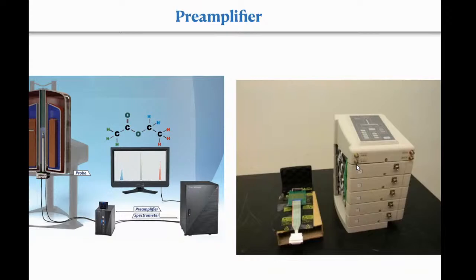Why do we require a preamplifier? Because the signals that we get are very, very weak, in millivolts or even smaller. We need to at least amplify it, because by the time this signal travels from here to the console here, it would have dissipated and your sensitivity will be lost. Okay, there will be so much resistance going through these wires, right? So you need to preamplify it. All the amplification could be done here, but at least we need to get it up a little bit before it is sent to the amplifiers or our signal generating unit.